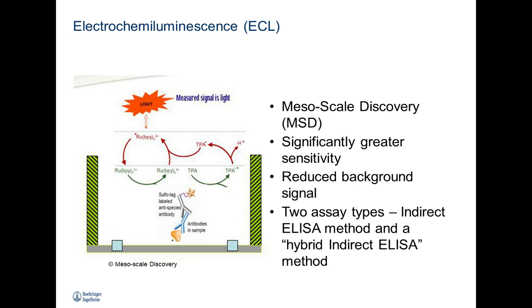And we've already talked about the basics of the MSD assay format and how their technology works. It does have a significantly greater sensitivity than your standard ELISA, and can easily get down to picogram per mil, even femtogram per mil levels of some analytes.